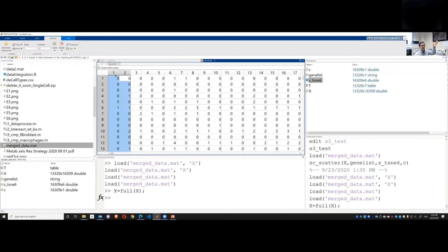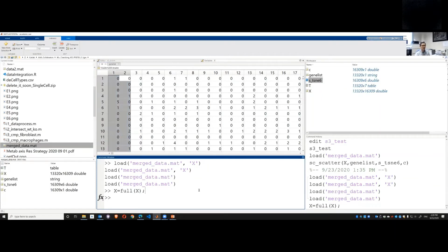If cell 1 and 2 are identical to each other, then your dimension reduction visualization will put them closer together in your picture. So I'm going to show you the picture for all the cells, using a built-in function I created.